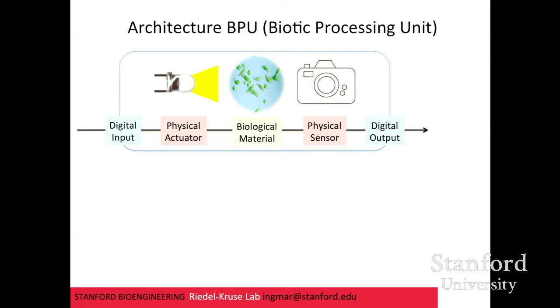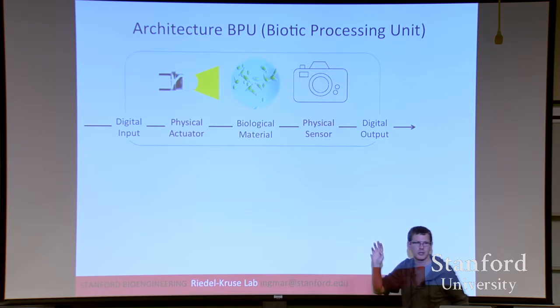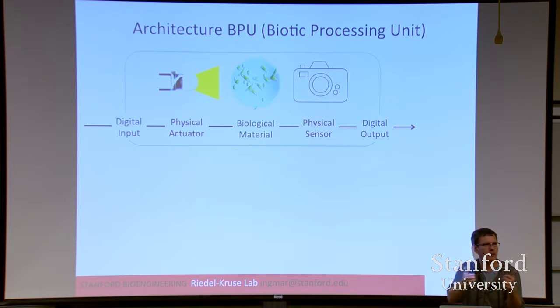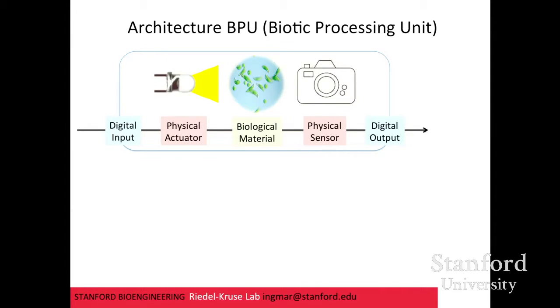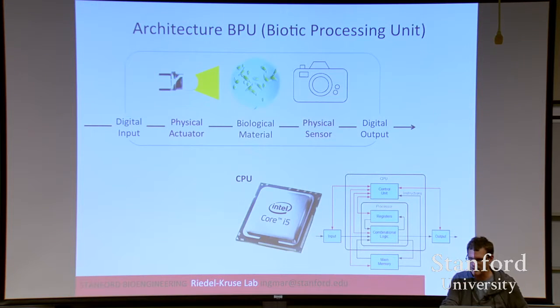And what would also be very useful is to have each of these setups, or these BPUs, interacting through digital input and output channels, right? I mean, you can imagine making this interactivity work by pipetting with your hand or visual inspection, but if you really follow this paradigm, then you can integrate this in any sort of existing framework, for example, a web interface. So that's the definition of a BPU: digital input output, and then you have biology in the middle that you can both measure and stimulate, right? And so you could treat it as any sort of electronic device that you have.